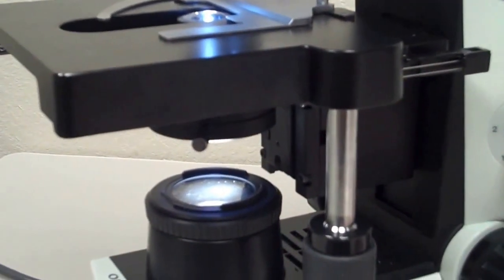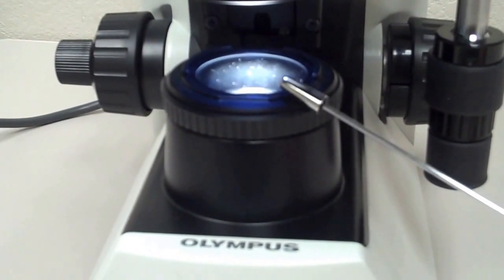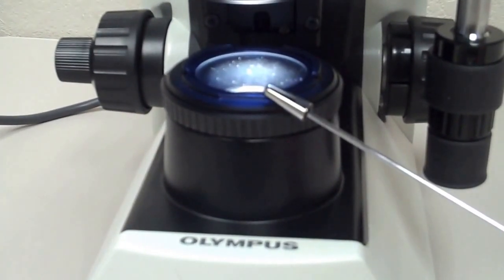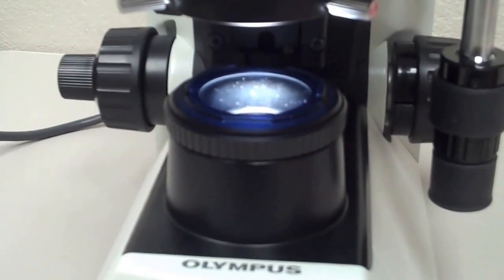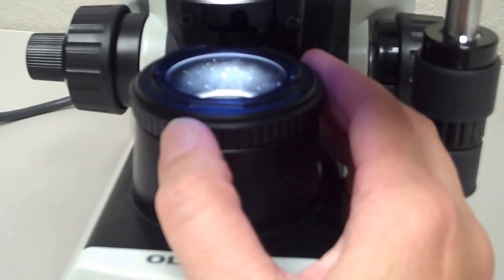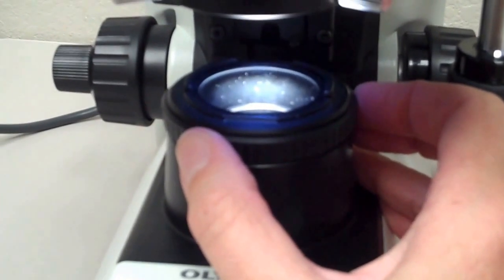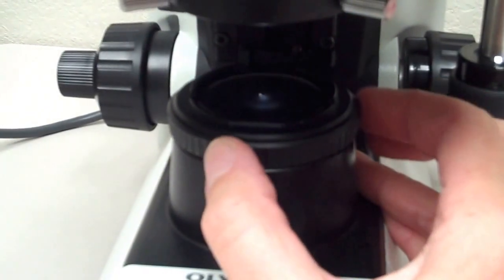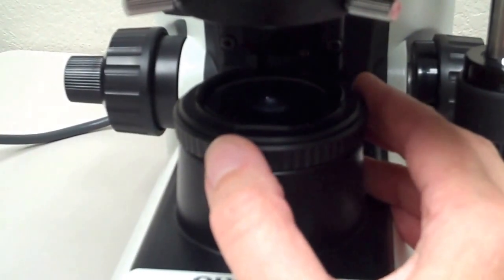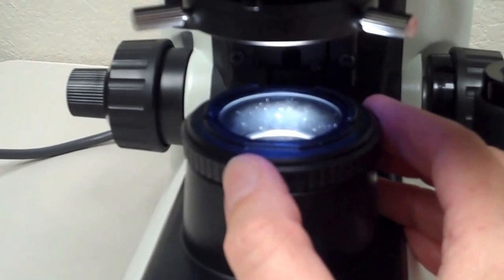This is a light microscope. Light is coming from the base and it's coming through this part of the microscope which is called the base diaphragm. The base diaphragm is one of the ways that you can control intensity of light coming into the scope. There's a ribbed knob on the outside — you can have it all the way open for full light, or turn it to decrease the intensity down to nearly none.